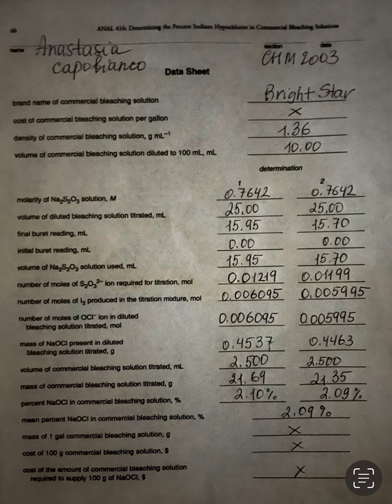So now we got 100 milliliters of our diluted solution. We added 90 milliliters of distilled water to make 100 milliliters of the diluted bleach solution. This number is the same as in your experiment. I kept it 10 milliliters, so it's a little bit easier for you to understand.